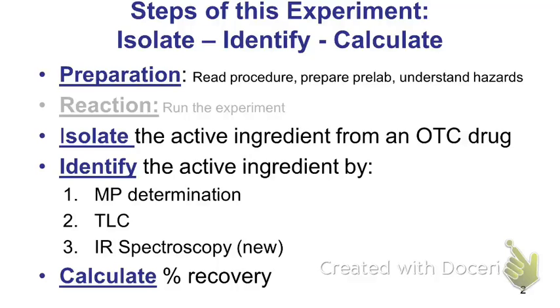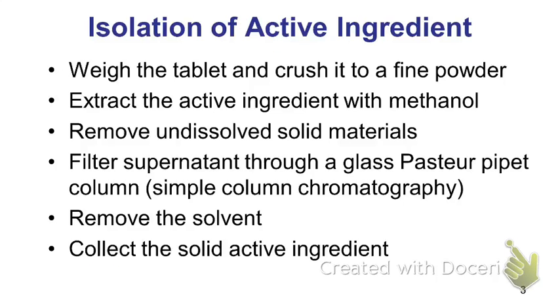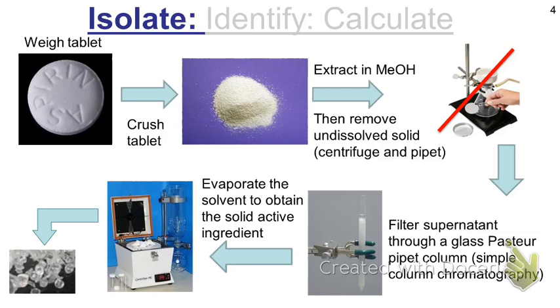Okay? As far as what you're dealing with in this case, just the ones that are kind of bolded are going to be the ones you're going to deal with. So it's a repeat of pretty much all of the techniques except for IR spectroscopy, which is slightly new. And then we're also going to introduce you to some new equipment as well. That's pretty much what is going to show up on the next slide, so we'll skip that because it's pictures.